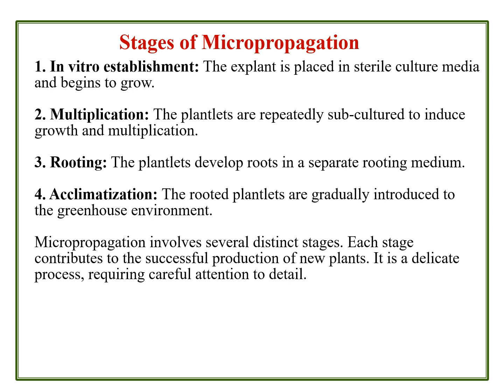Prior to establishing the plant part, the plant must be surface sterilized with a variety of chemical sterilants, followed by distilled water sterilization. Prior to the sterilization, media must be prepared involving the major and minor nutrients.